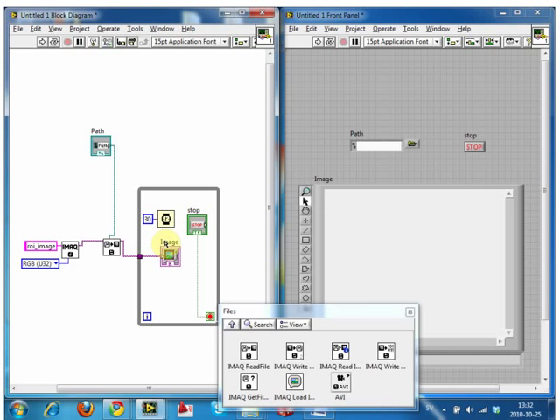So what was this memory thing that you said? It will also slow down if you don't put in this trash bin. If you clean it up, we'll do that at the end. It's just for correct programming: you should destroy everything you create. Okay?